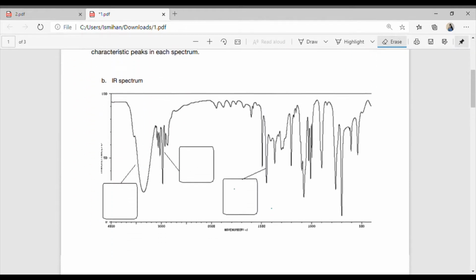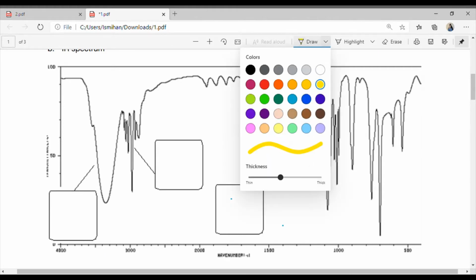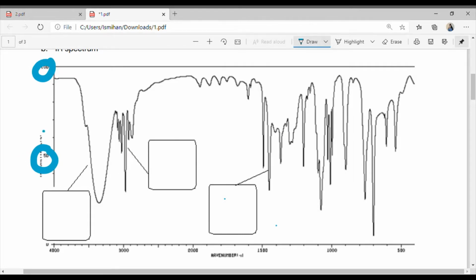In this first one, this is an infrared spectrum, as we see. And infrared is based on how much transmittance goes through. So on the side, we have these transmittance numbers, and these just show how much of the wavelengths went through in the spectroscopy. So something up here towards the 90 mark shows no molecules present because all of the transmittance is going through, 100% of it is.